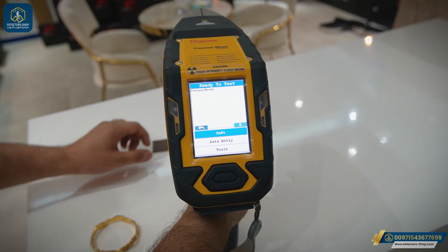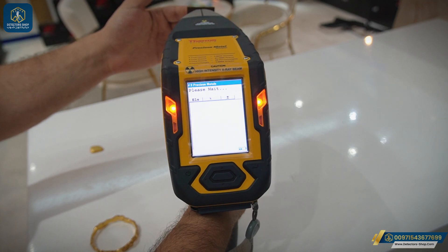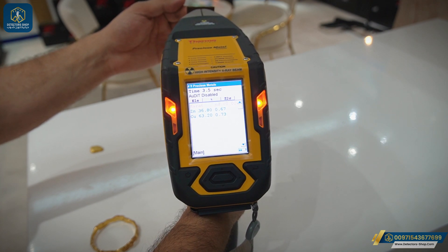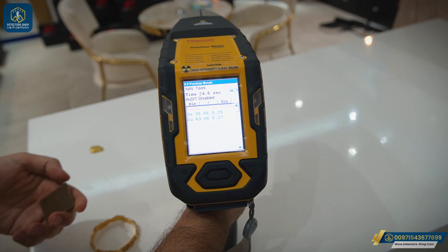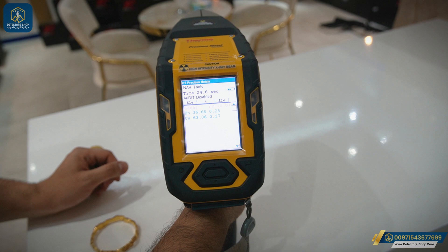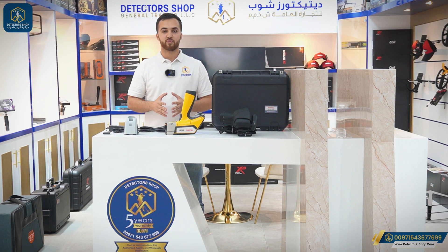Now we'll do a test on a piece of copper to see the analysis for it. We're going to press the trigger for 20 to 30 seconds. After the analysis, we can see we have zinc at 36.66% and copper at 63.06%. The XL2 comes with one year of warranty, plus you can get an additional two years.